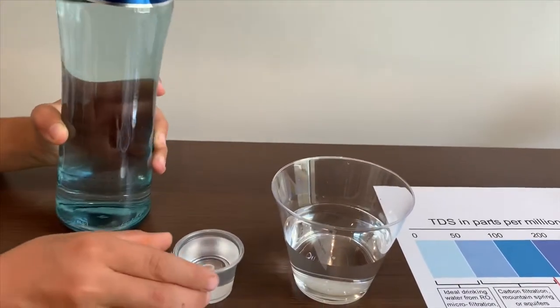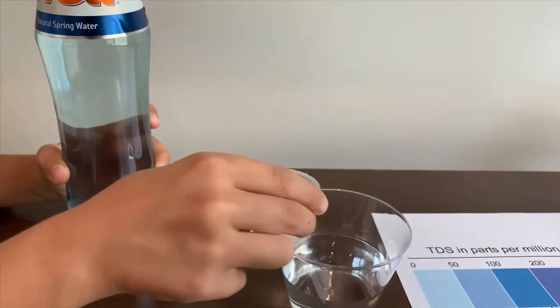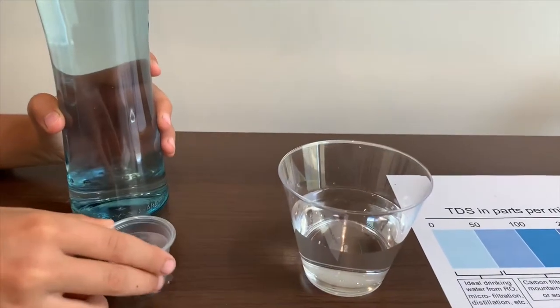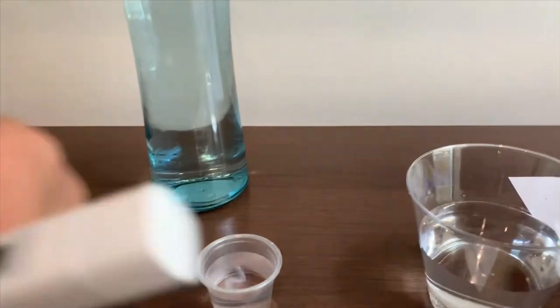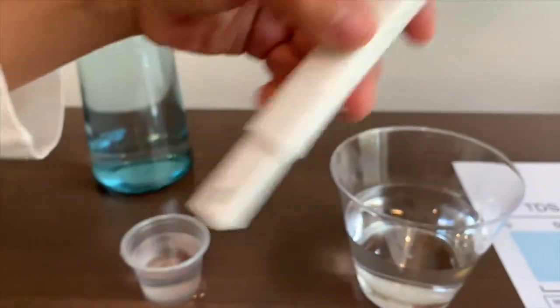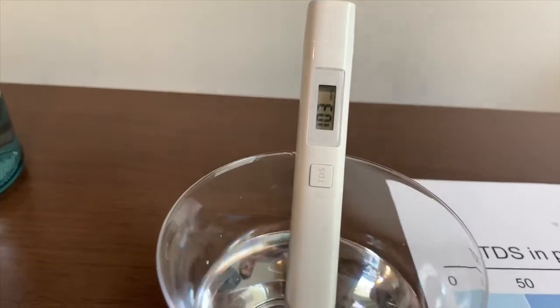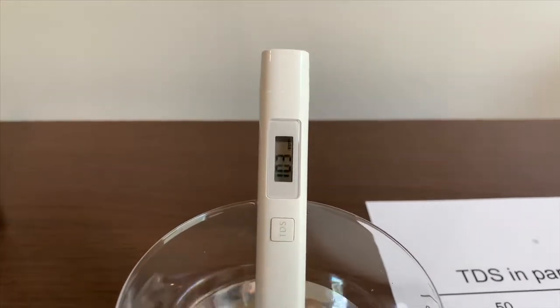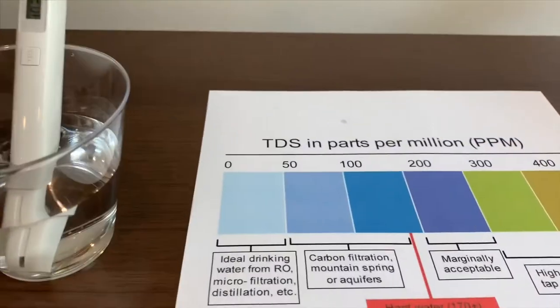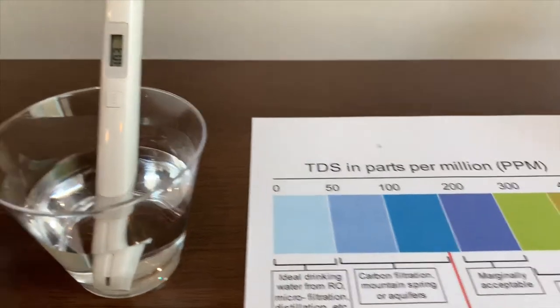We don't want too much, so let's put it in half. Turn on the TDS tester, make sure it says zero, and put it in. It is 103. That means it is okay to drink.